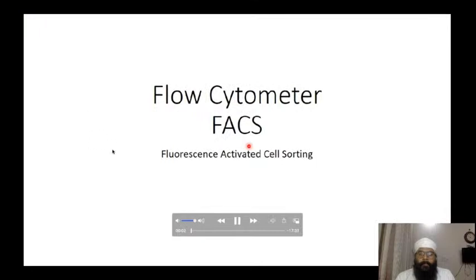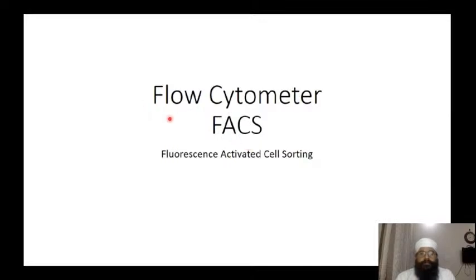Hello, guys. This is a continuation of our subject, flow cytometer and FACS mechanism. In the previous video, I spoke in details about flow cytometer, and in this video I'm going to speak about FACS mechanism, fluorescence activated cell sorting. If you didn't watch the previous video, I highly recommend you to go and watch it, because it will be much easier to understand FACS mechanism if you fully understand the flow cytometer mechanism. So let's start speaking about FACS.